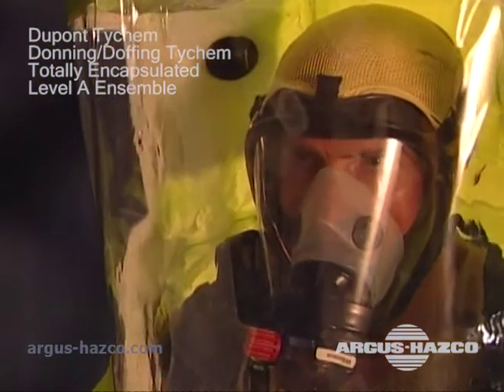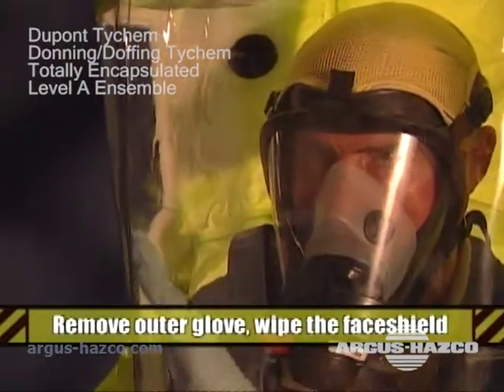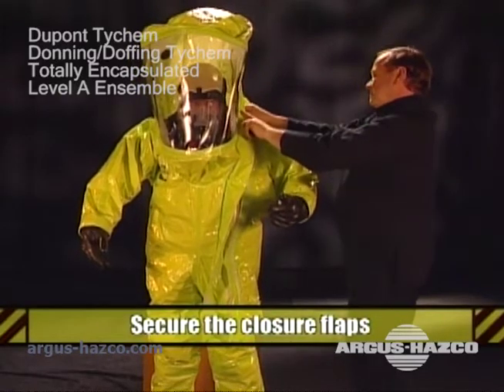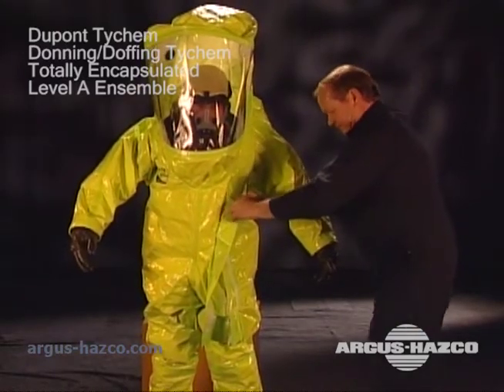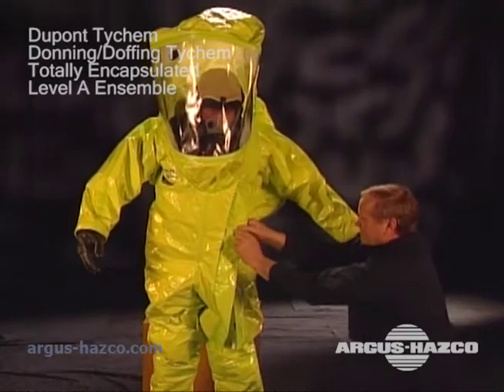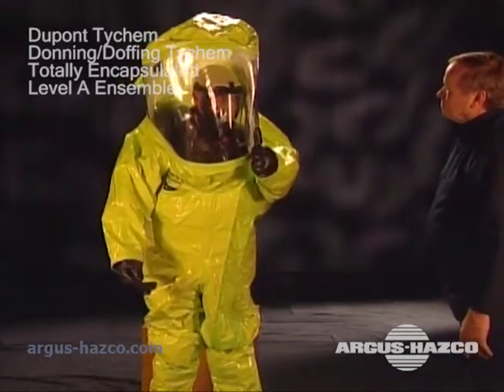Now that your suit is zipped, check to see if you can remove your hand from the gloves and wipe the face shield. Now your assistant should secure the closure flaps over the zipper. Start at the top of the closure and work your way down. Make sure the closure is secured. Now you're ready to do your job.